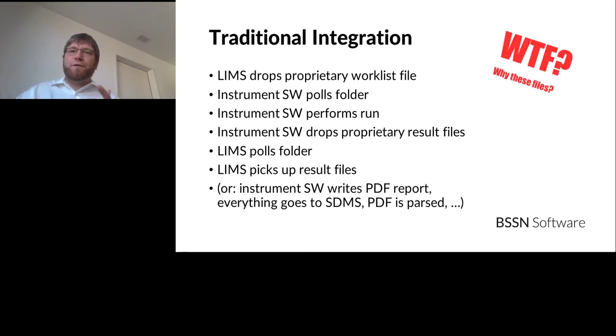So the first thing is, why these files? We need to get rid of these files. We need to make sure that we get a proper control flow and a proper data flow going, so that it's not a fragile construct where I drop a file, I hope something will happen. I have no idea whether the other system is actually running. I just hope it's running and picks up the file, does the work, and eventually comes back to me. There is no status information. There are no events. I can't send a command to that instrument. And when I get the data back, that data is in all kinds of formats. So it's really hard to use that data downstream.